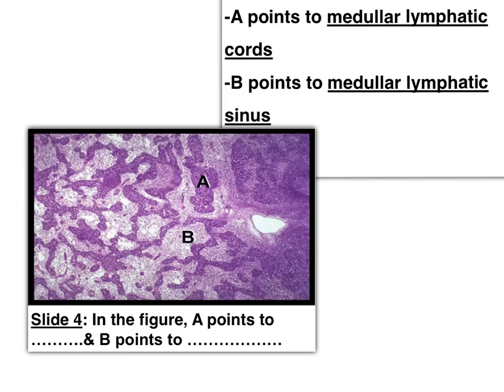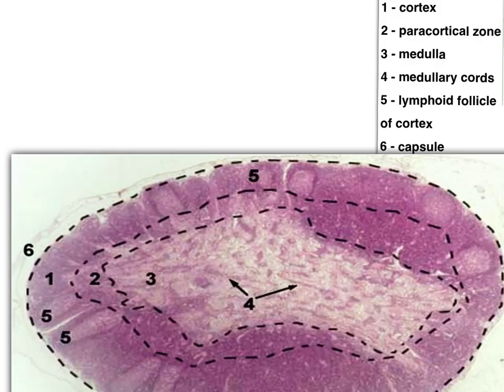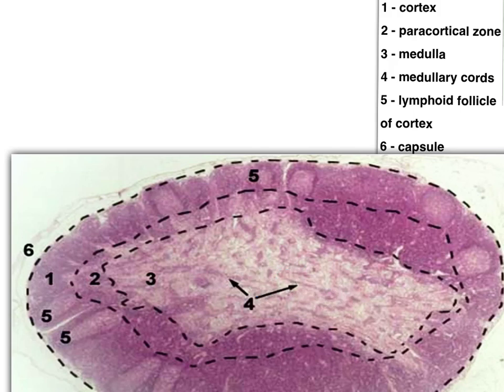Letter A points to the medullary lymphatic cord, while letter B is the area in between these cords — it is wide and pale, so it is the medullary lymphatic sinus. This is the lymph node because we can see the follicles at the periphery and in the medulla we have cords. So it is follicles on the surface and cords inside.